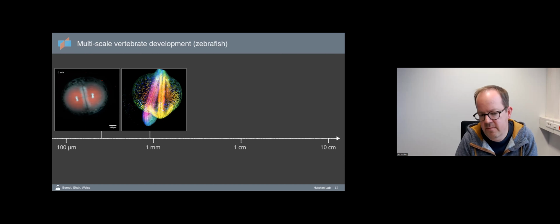This is something we've spent a lot of time on, trying to optimize these kinds of movies. And still, I think the challenge here is to be able to image something not just quickly, but also compress the data quickly, being able to image not just 1 or 2 embryos, but ideally many of these embryos, to be able to come up with some sort of systematic imaging scheme, which also leads then to some sort of a model, a blueprint of how the embryo develops.